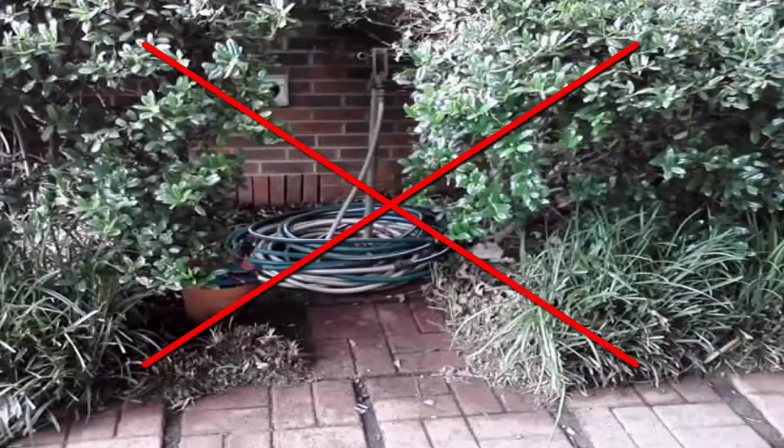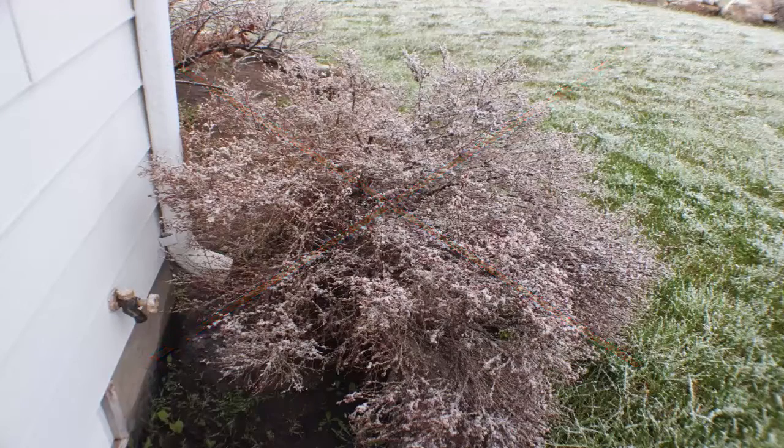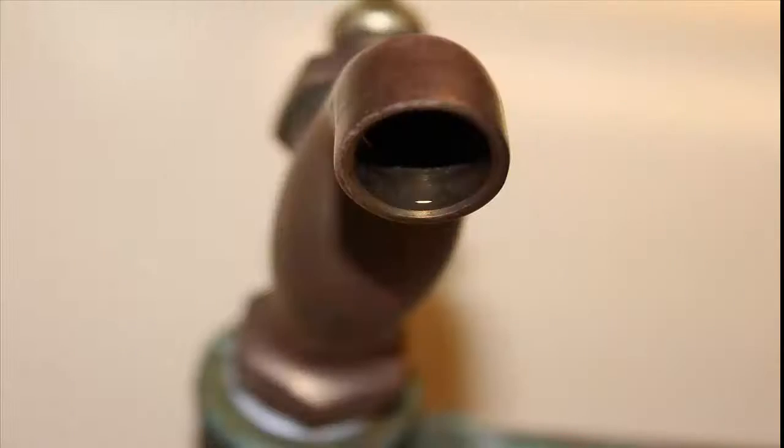Find a clean environment and avoid faucets surrounded by heavy shrubs or plant growth. If collecting your sample outside, avoid poor weather conditions such as strong winds or any precipitation. You don't want airborne bacteria to get into your sample bottle.